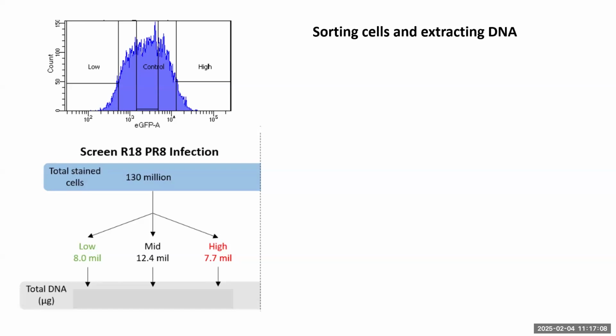For example, with influenza virus, we had to optimize the staining with the HA or the M2 antibody. A lot of that was to do with which virus we used, because some of the antibodies worked well with some of the viruses like PR8. Some of the avian or swine-specific viruses didn't work very well.